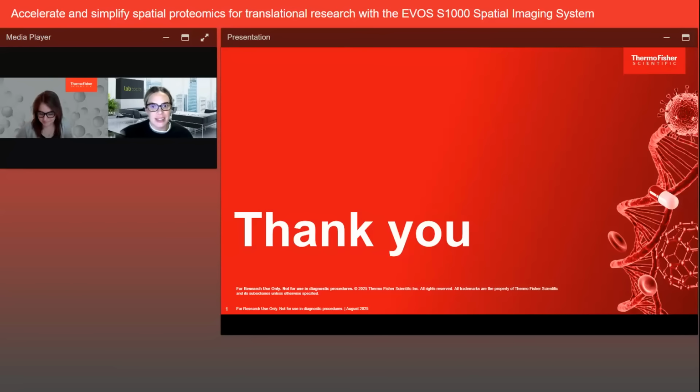Okay, fantastic. The next question that we have here says, can you save the 9-plex protocol / dye setup so that it can be used in the next experiment? Yeah, that's a really good question, and maybe I take this opportunity to highlight a few things of the actual imaging workflow. So our recommendation is that you don't need to know even beforehand as a user if there is a requirement for a mixing.